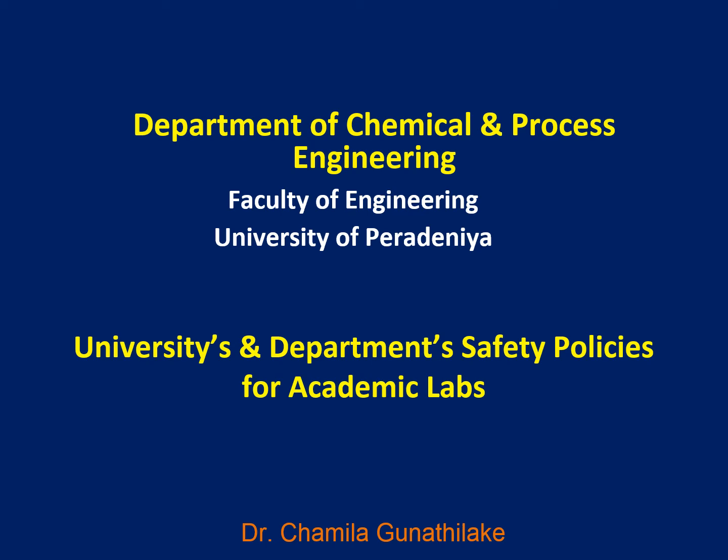Good morning, everyone. Today, I would like to share the university and department safety policies for the academic labs. I'll give a 45-minute to 1-hour lecture, and after that you will be given questions we call a scavenger hunt, and you will have about 3 hours to complete it. The scavenger hunt contains questions based on the presentation that I am going to cover today.